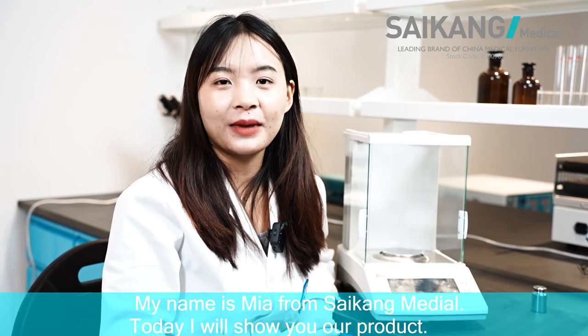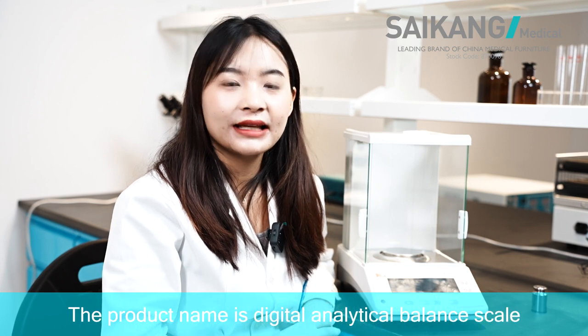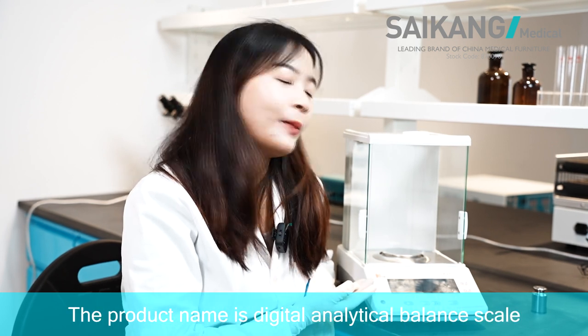My name is Mia from Saikon Medical. Today I will show you our product. The product name is Digital Analytical Balance Scale.